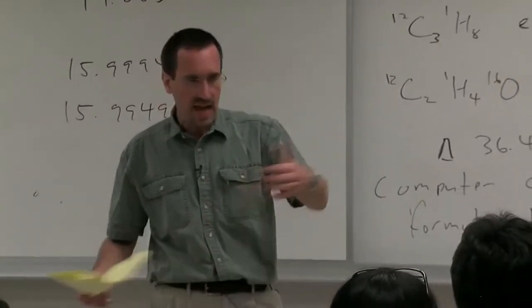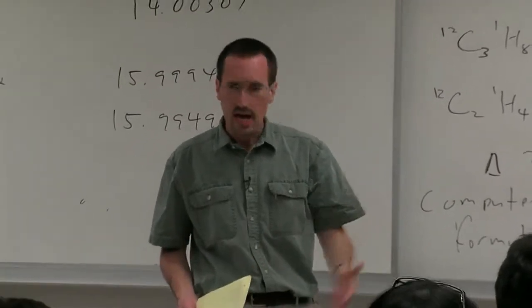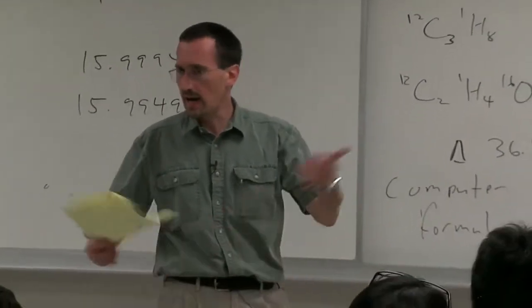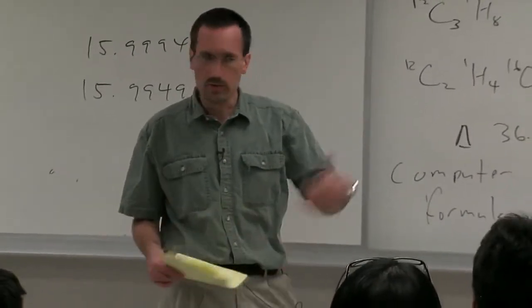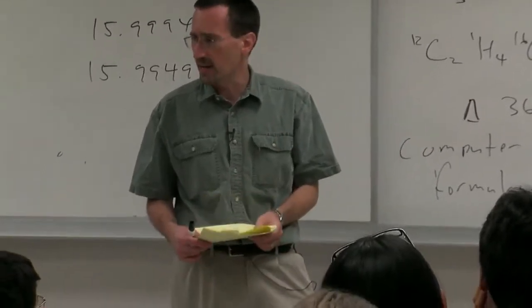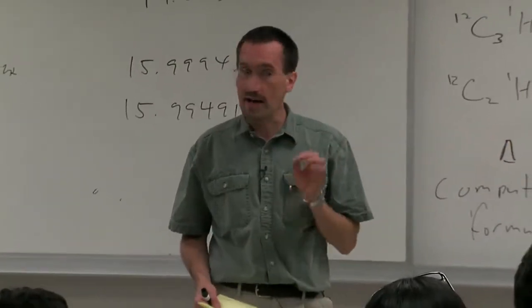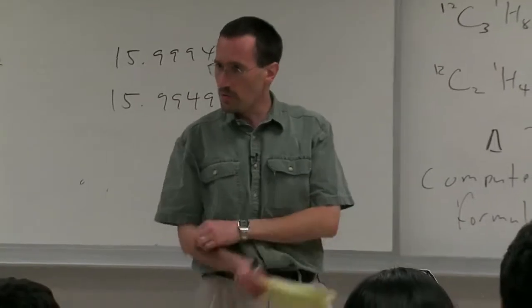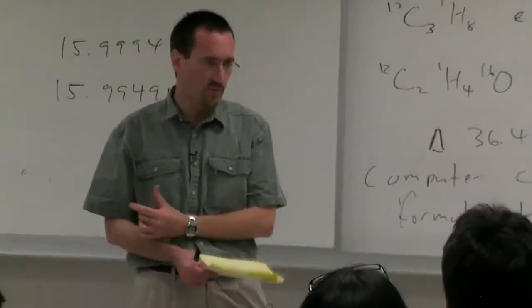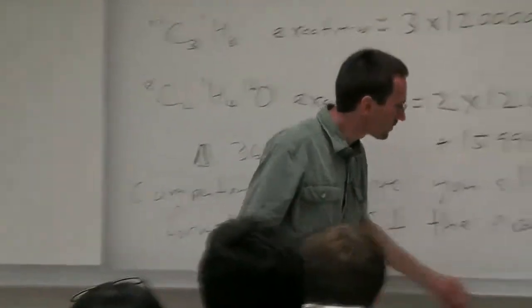You don't want to give it half a molecular weight unit or you'll get many compounds. And you say those compounds could have up to 10 carbons, up to 40 hydrogens, up to 5 oxygens and up to 5 nitrogens, and you'd find out. For a molecule this small, you'd find this is the only fit. Or you'd find maybe just a couple of fits, but some of them would have absurd formulas like 5 nitrogens, 1 carbon, and 1 hydrogen.